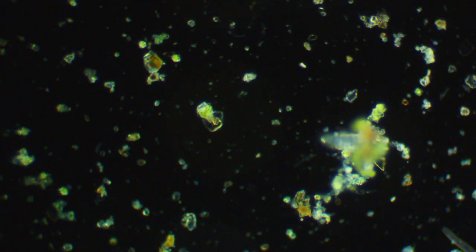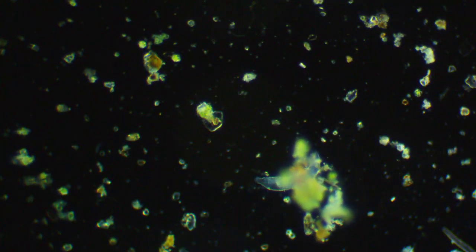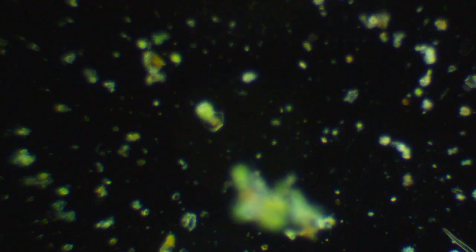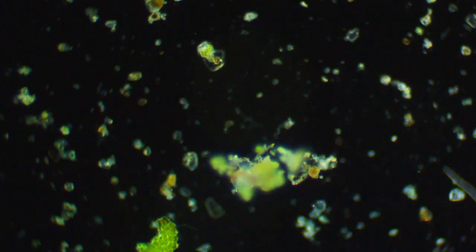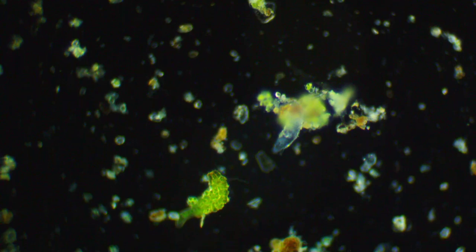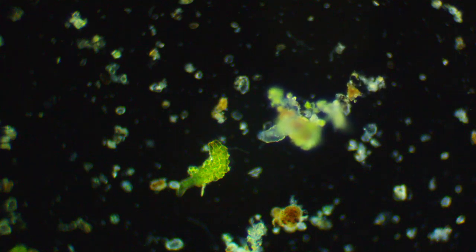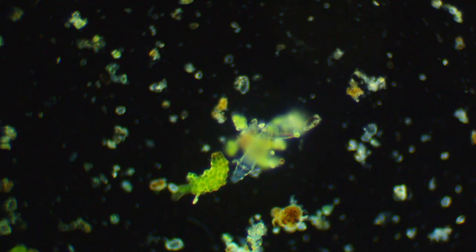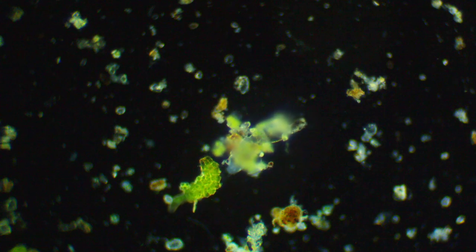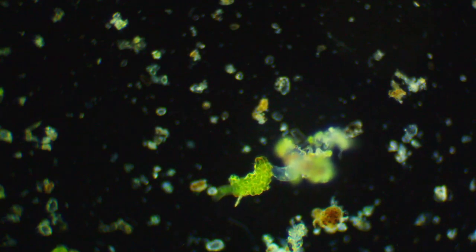What's weird is that sometimes you see these rotifers crawling around like this on the glass, and this guy's like weighted down. But then other times you see them just swimming through the water with their little rotifer wheels out. Rotifer means wheel bearer. This guy right here is not really doing it, but when he wants to eat or move water around, he sticks out his little face and it splits open and two little wheels start spinning. It's really not wheels, it's cilia hairs that he spins around in a pattern that makes it look like a wheel.